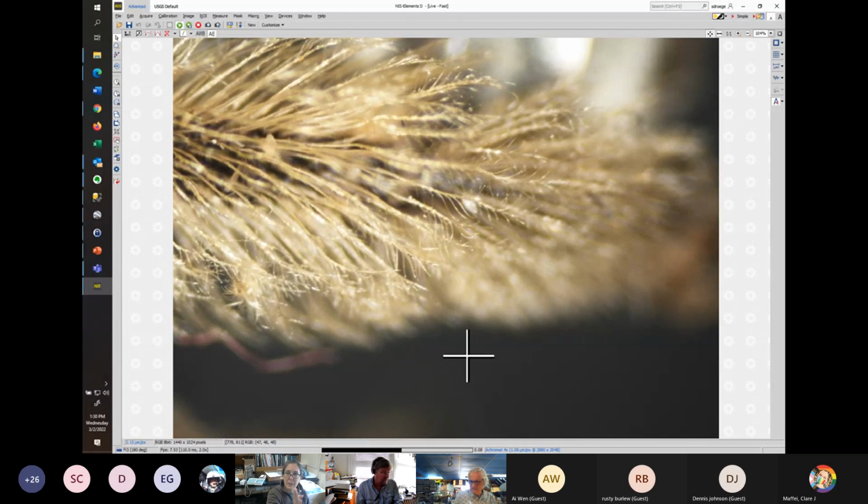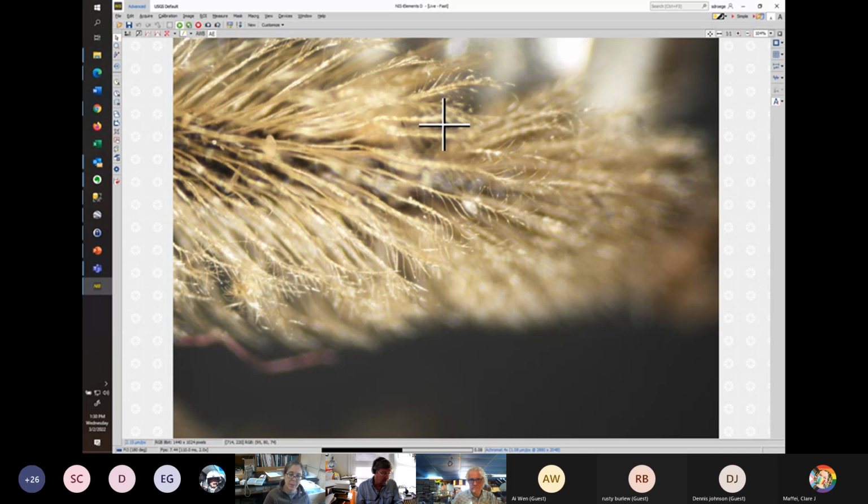So the other species can be wavy, they come off the main rachis and they just kind of curve away, but they don't have this crazy look to them. Yeah, all these different S curves and things like that going on. So there are only two species with this character, with the crazy scopal hairs.